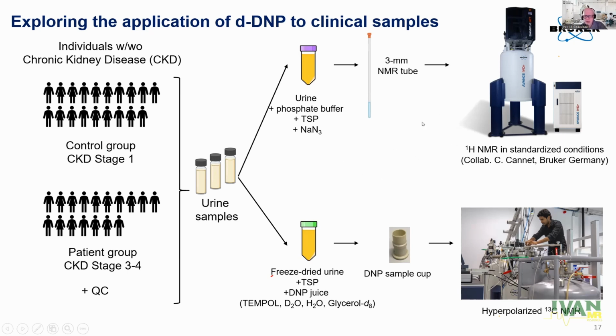And as you will see later, the IVDR proton NMR data were processed in two ways. They were processed with conventional bucketing, like in conventional NMR metabolomics, and they were also processed with deconvolution and pattern recognition approaches, which is the approach that Bruker calls the IVDR method. And so we did all this, and then we did some classical statistical analysis, which are done in metabolomics, and then we tried to compare the different methods.